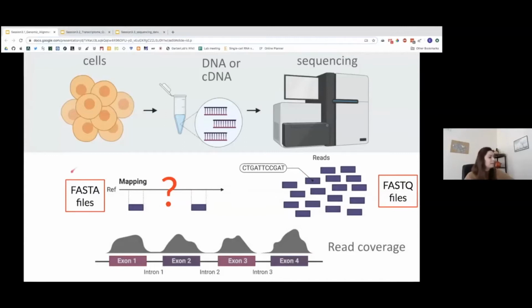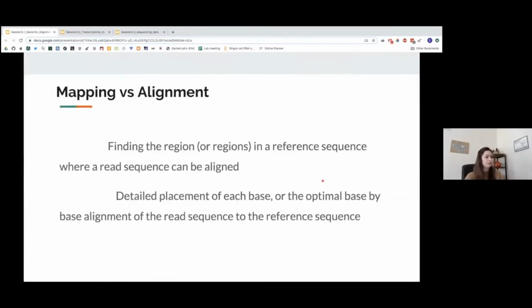You also know that the reference genome for the mapping is contained in FASTA files, so you have all the bases to get this process started. After the mapping, we can generate the coverage profiles and start to interpret this information. We'll go through the analysis that we mentioned for RNA-seq and for genome alignments and go into some details.